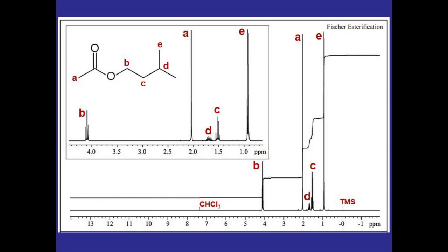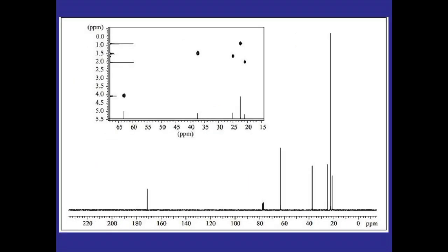Now that we have all of the peaks labeled on the H NMR, we can move on to the carbon NMR, and the process is going to be basically the same. You want to draw out the molecule and label all of the unique carbons. To easily distinguish the carbons from the hydrogens, let's have everyone label their carbons as numbers. Then, starting at the same end as before, moving to the right, I'll label all of the unique carbons, and as you can see, there are 6 unique carbons on this molecule.